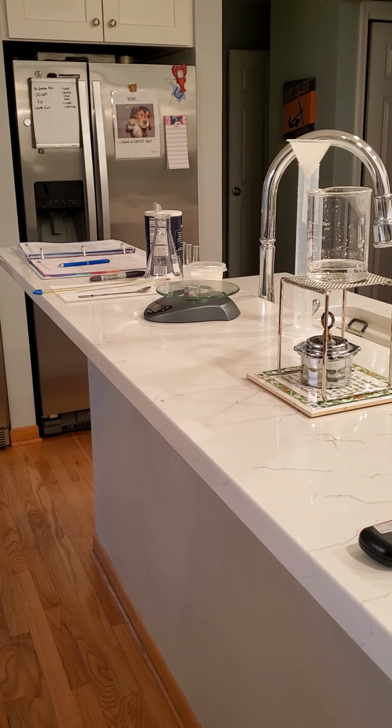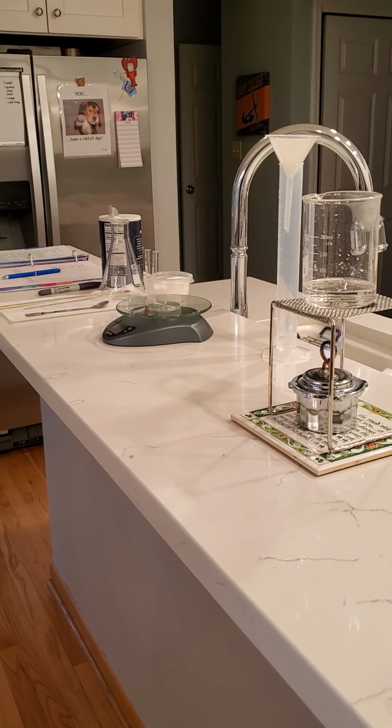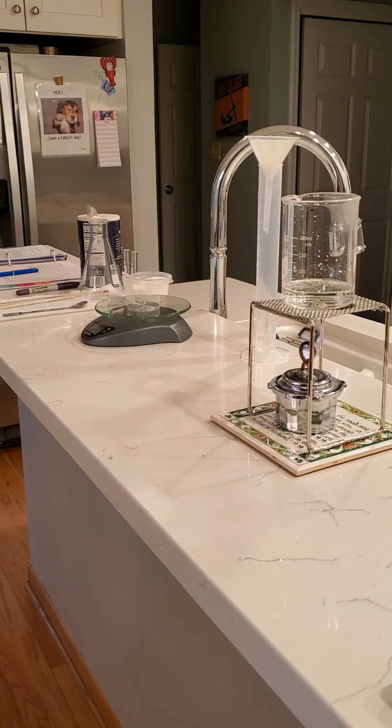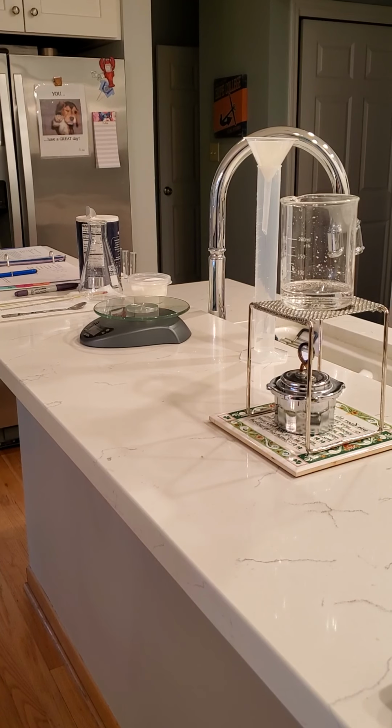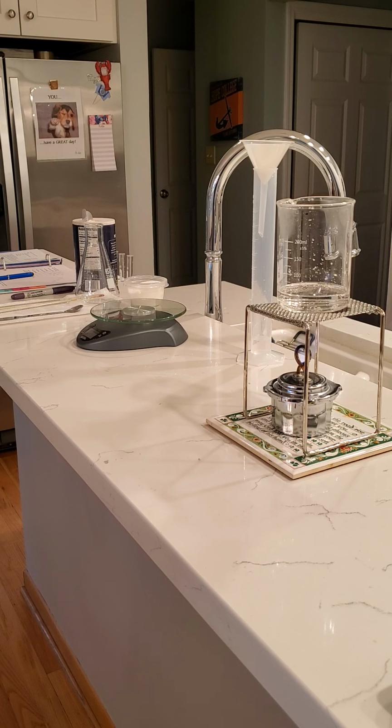Okay, class, so I think you can see now that we've heated this beaker. It's starting to boil a little bit, so the water is starting to evaporate. Once all the water is gone, we don't want to heat an empty beaker. We don't want the beaker to break. So we'll just give this a few more minutes and we'll let the beaker cool after the water is gone, and we'll get our weight of salt that's left with the beaker.